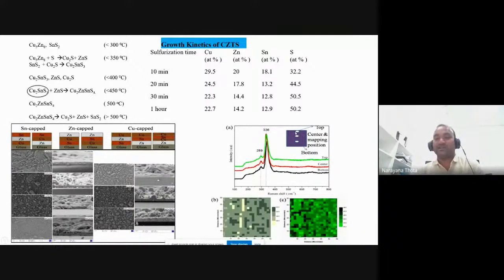We collected spectra from the top and bottom at 3 different points. Almost all the Raman spectra show the same signal. That means the film is also uniform. This is the Raman mapping conducted over these samples.